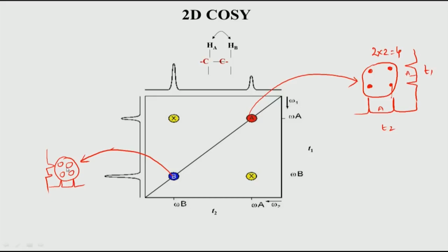This whole thing, our center, is the actual chemical shift value, because remember the chemical shift of A is not this or this, it is at the center. Similarly, the chemical shift of A is again here, the center. So, the center of this peak is our actual chemical shift value, and that is what we are interested in and not in the coupling. Okay. Now similarly, the cross peak will also have a multiplet structure inside it, but as far as the analysis is concerned, we normally do not consider that. We only focus on the overall position, meaning the value of the chemical shift here in the center.